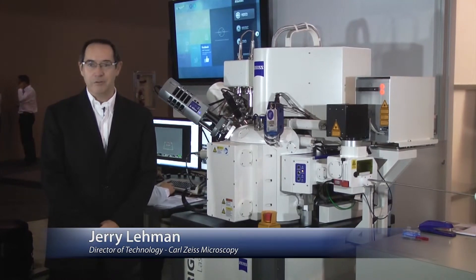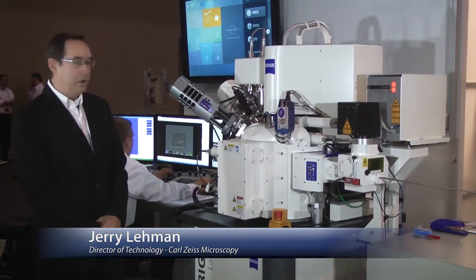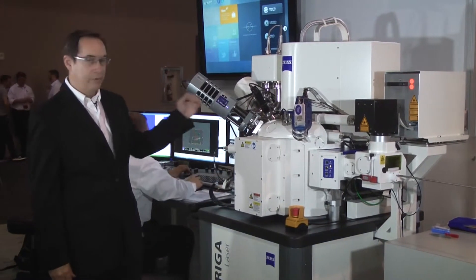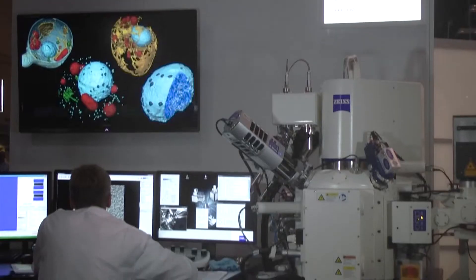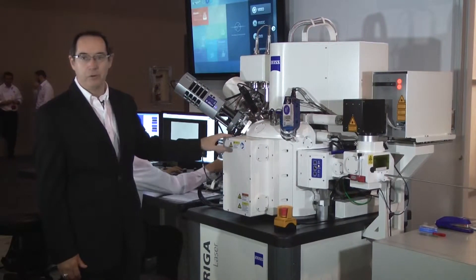Hi, I'm Jerry Lehman. I'm the Director of Technology for Carl Zeiss Microscopy. What I wanted to show you today is our electron microscope with a focused ion beam and other attachments on it. We call this a crossbeam.